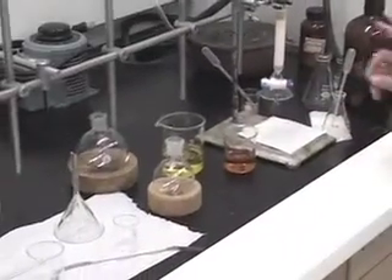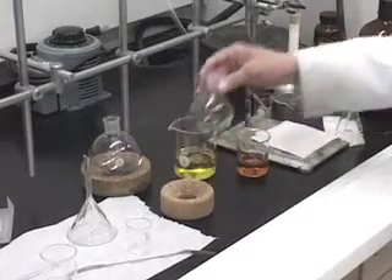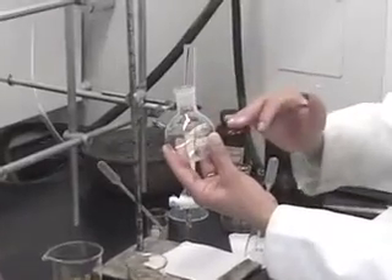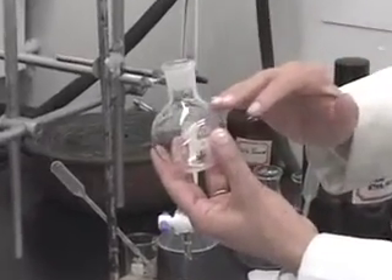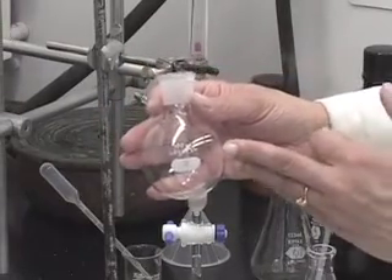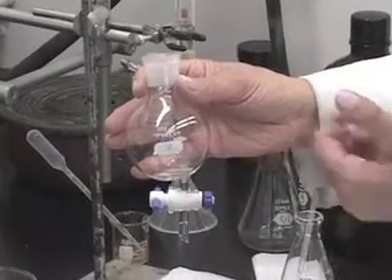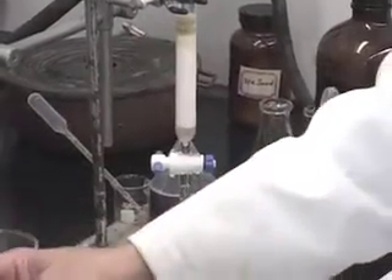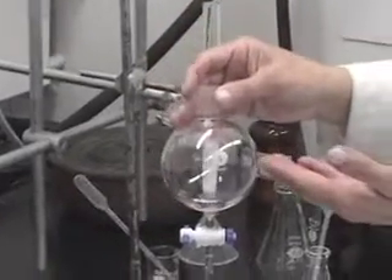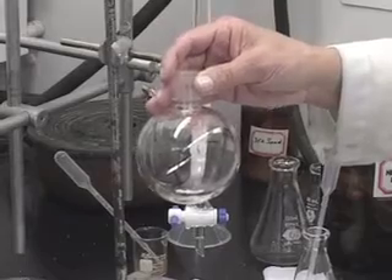Whenever we use the rotary evaporator to evaporate off the solvent, you want to never fill the round bottom flask more than half. In other words, if this is a 100 ml round bottom flask, you do not want more than 50 ml of solution in it. This being a 250 ml flask, you do not want more than 125 ml of solution to go in there.